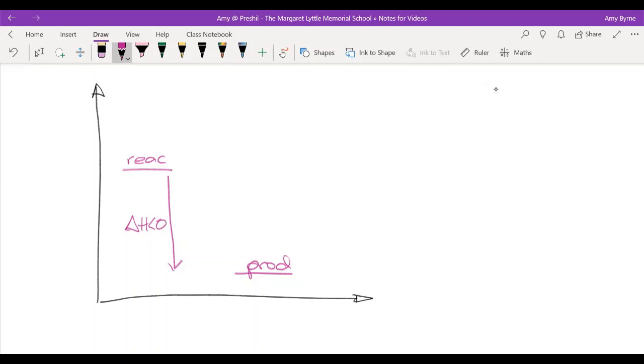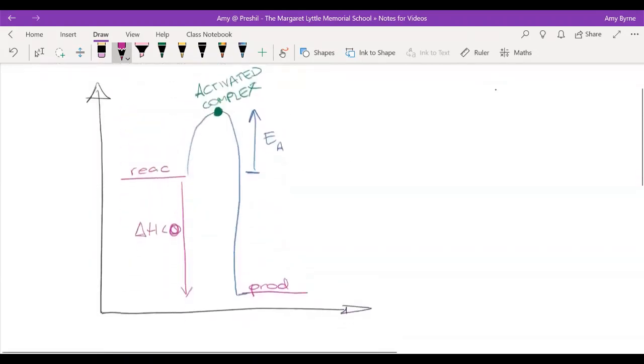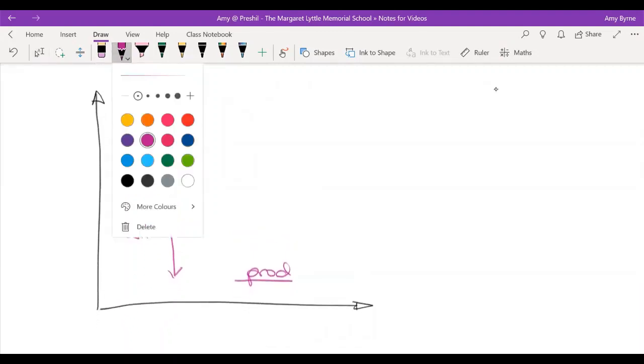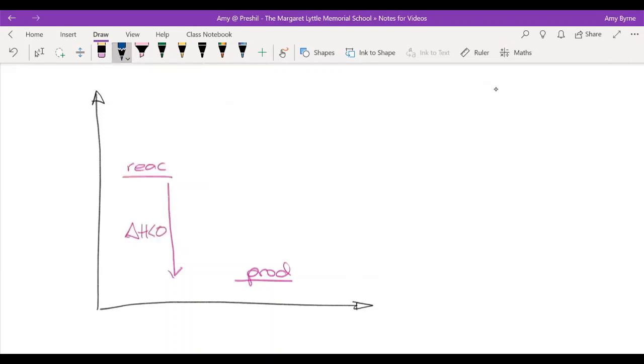This delta H that I've drawn in this second diagram is exactly the same magnitude as the one I've drawn on my first diagram. What adding that cobalt does though, it gives a different step. It provides an alternate reaction pathway. So first, I have my peroxide reacting with my cobalt, and then I have my cobalt reacting with my Rochelle salt, my tartrate ion.